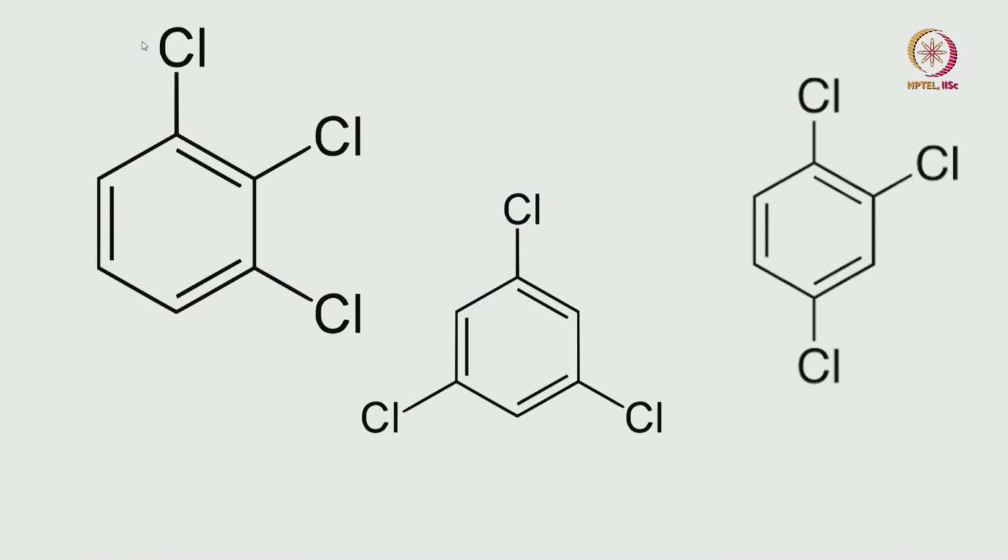We took the example. For example, in this case, I will just go back to what I showed yesterday. These are the three molecules which I showed. These are all trisubstituted benzenes. There is enormous symmetry in this molecule. For example, all the three protons are chemically equivalent. This is what we discussed, chemical equivalence. As a consequence, the charge density distribution at the site of each of these protons is identical. So, we are going to get a single peak for this molecule.